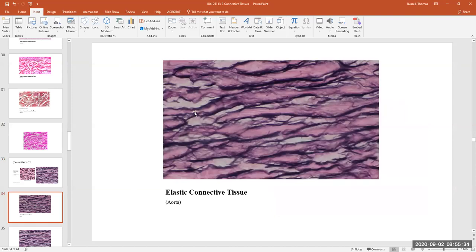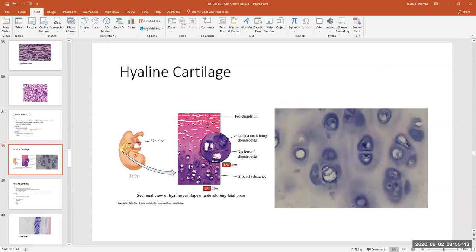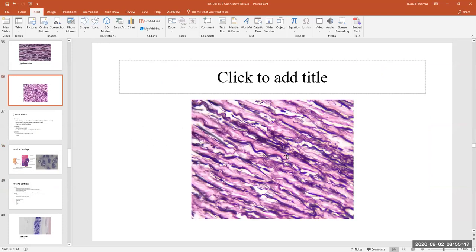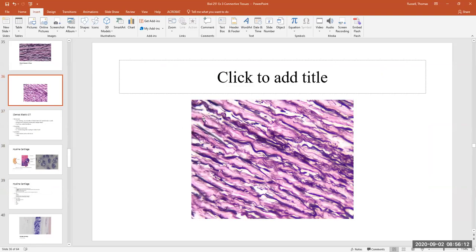Here are a couple other pictures of elastic connective tissue — this section was taken from the aorta. You can see the little squiggly lines everywhere — those are the elastic fibers. The dark wavy bundles are the elastic fibers scattered in between pink collagen fibers in some stains. So it's a scattering of collagen fibers, but the identifying character again are the elastic fibers.